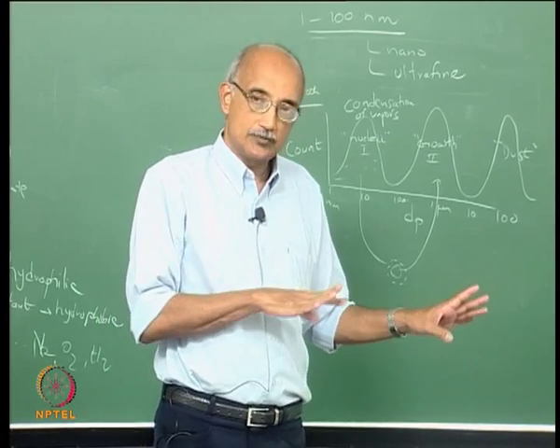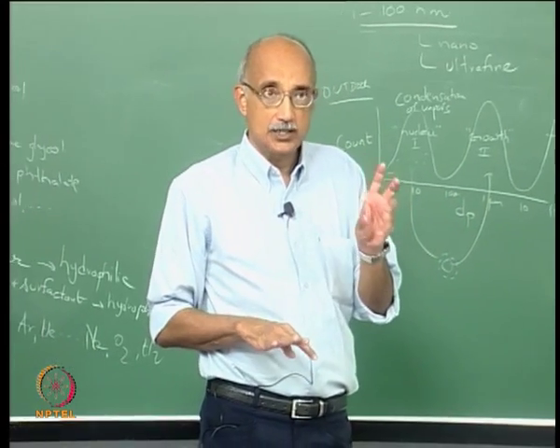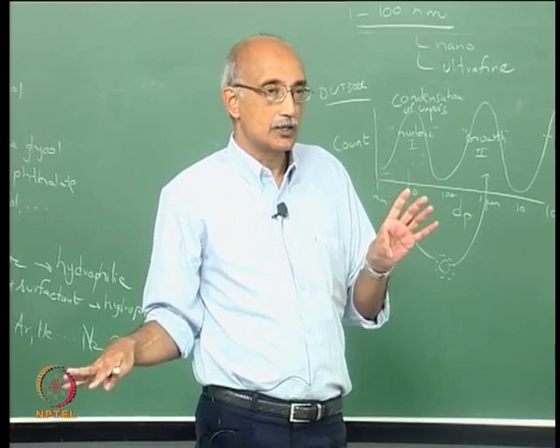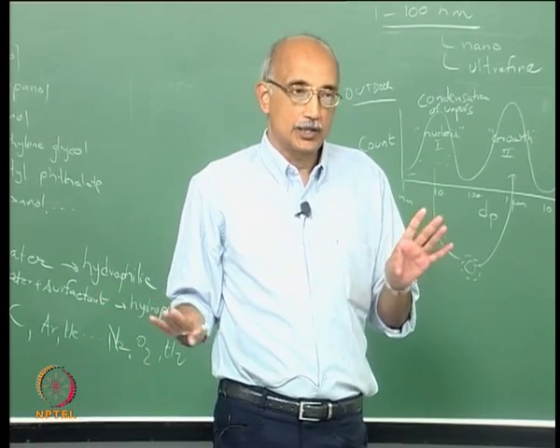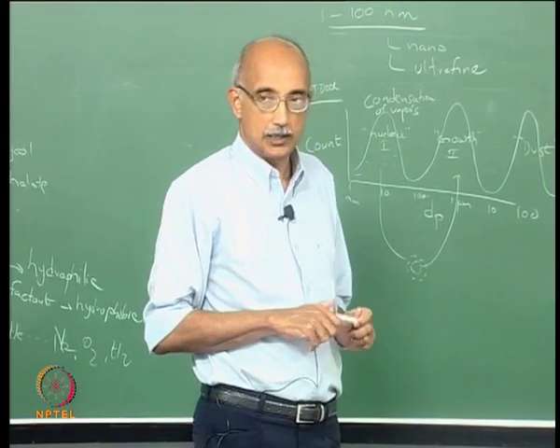But we still come back to the fundamental question of how do you translate the sizes that you measure with a condensation nuclei counter to the sizes of the ultrafine particles that were present to begin with. So, just think about that. In the next lecture we will start out by describing a method that enables us to do that.